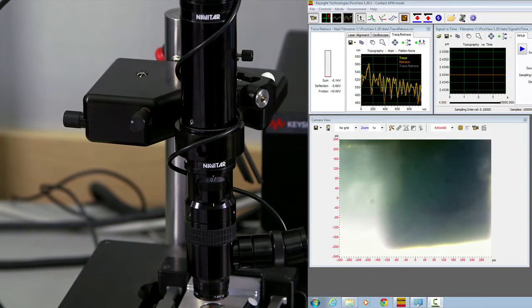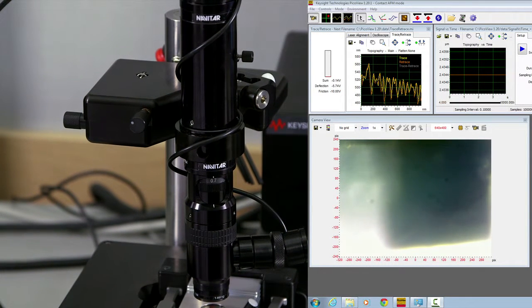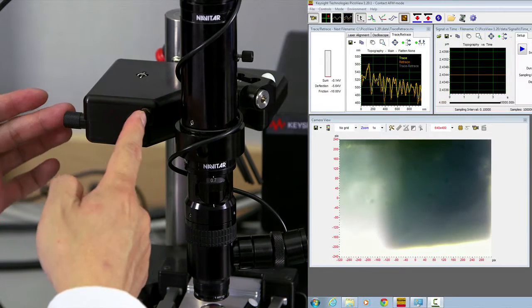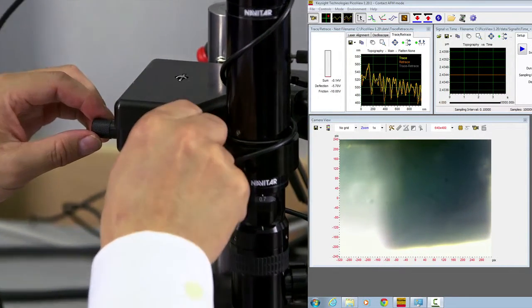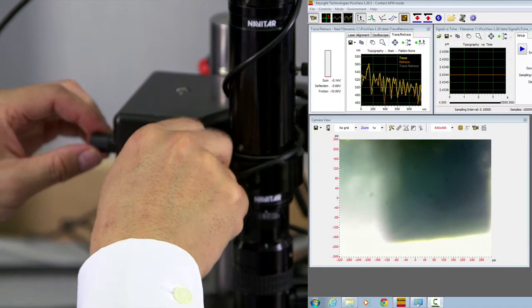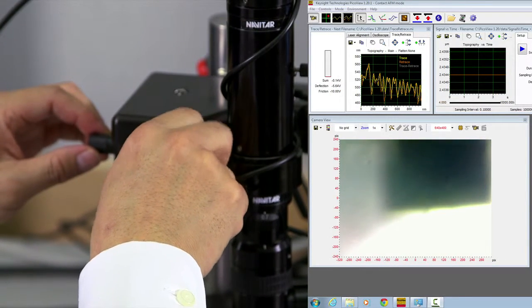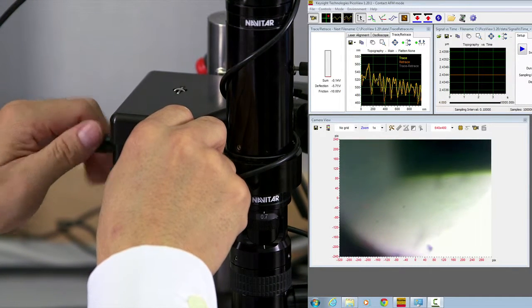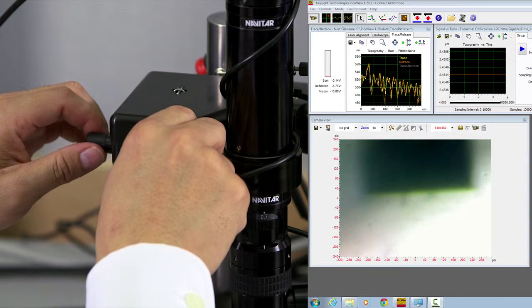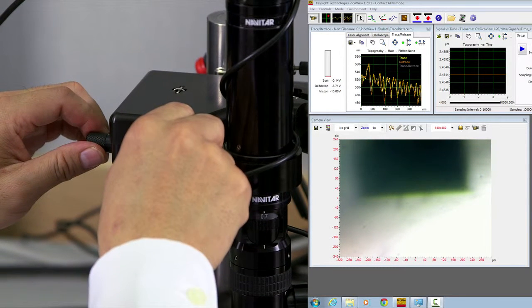There are two knobs that adjust the XY translation of the optical microscope. Here and here. You can look at the screen and adjust the translation until you see the brief shape of the cantilever tip and then translate them into the center of the optical view.